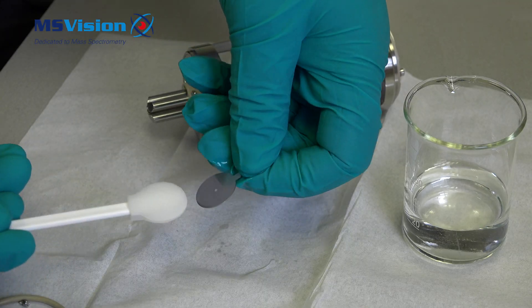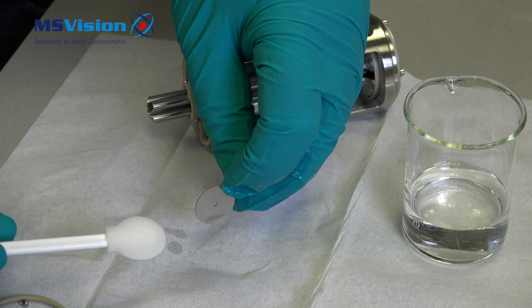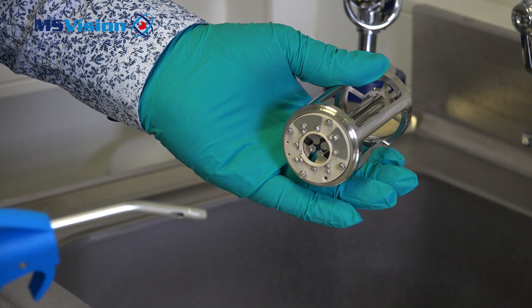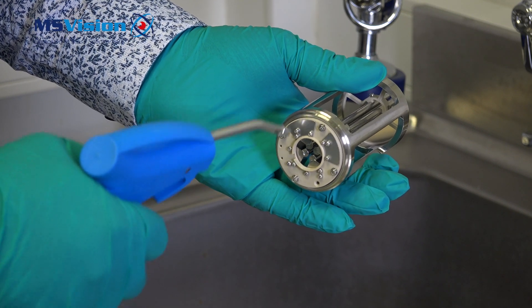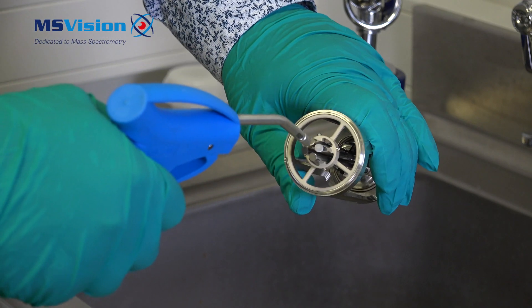Then take the lens and wipe with methanol or IPA. If needed, 1200 grade micromesh can be used to remove stubborn stains. If using micromesh, rinse thoroughly with methanol or IPA and dry with nitrogen.